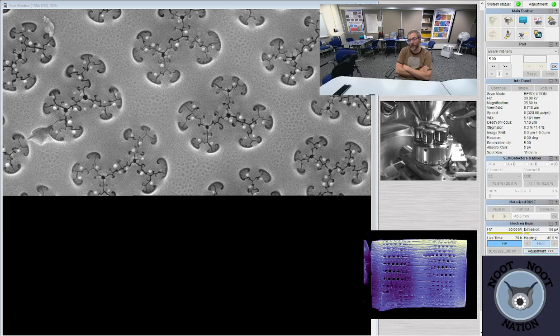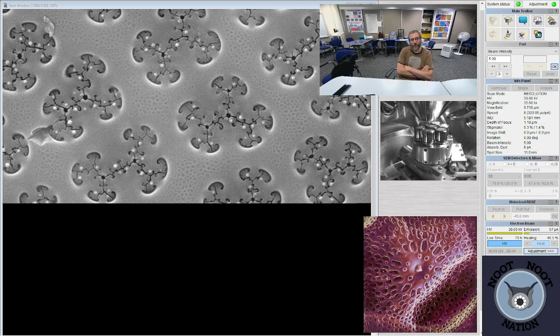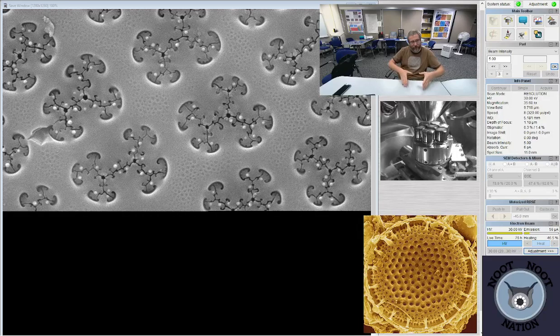There's a bunch of interesting stuff that goes on when diatoms can't make a shape that I think would be really interesting to look at. You know, these aren't all identical. Some of them are sort of squares, and some of them are X's, and some of them are Y's. And I think it's because they build it, and then they have to kind of fill it in, right?